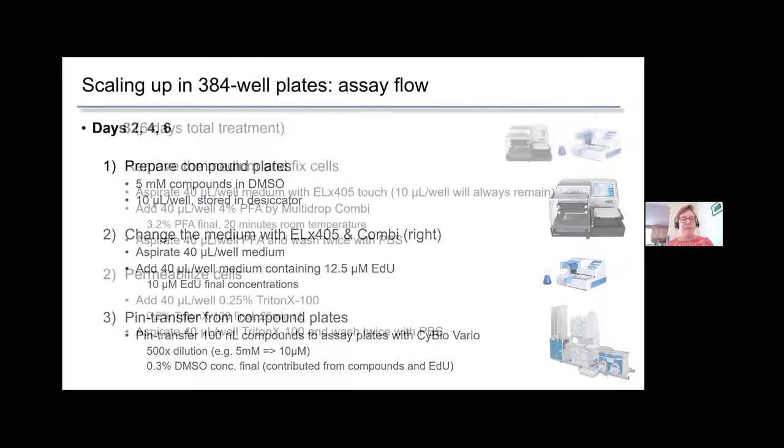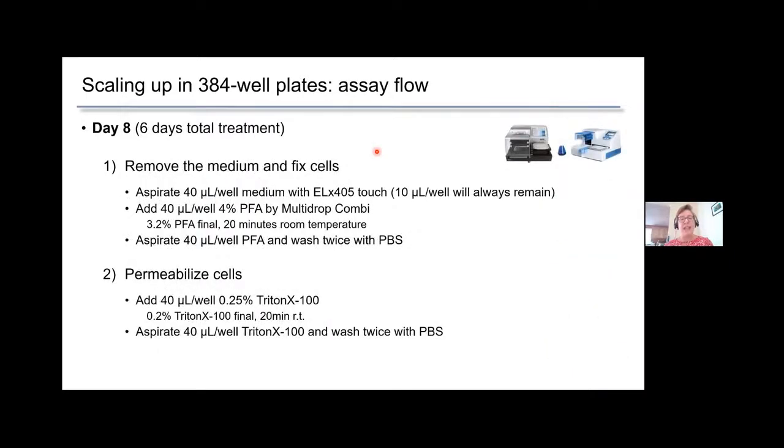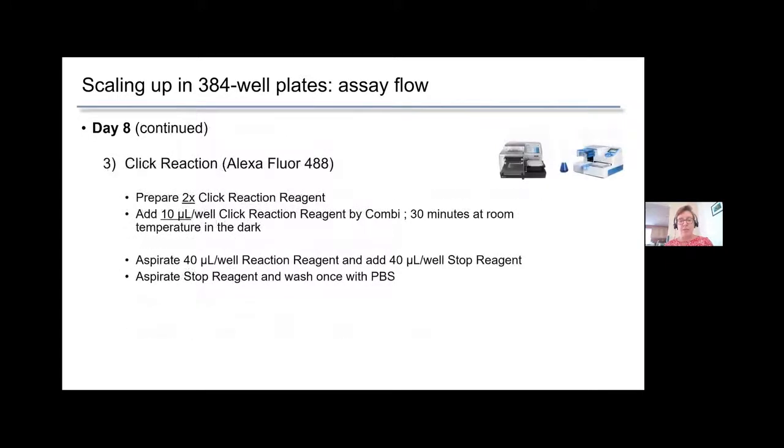Okay, so after 6 days total treatment, and here we are changing the media and changing the compound every 2 days, we remove the medium and fix the cells, and again, always 10 microliters per well remaining in the wells. We fix with PFA, wash twice with PBS, and then permeabilize with Triton X-100. And then we perform the click reaction. This is all according to the manufacturer's protocol. It's pretty straightforward. This is a click chemistry-based reaction to attach the fluorophore to, remember, the alkyne of the EdU.